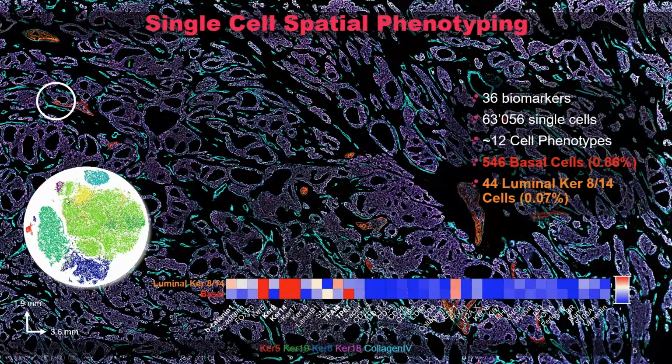You can see a very large contingent here of sort of green cells. Those will be luminal cells, a type of epithelium. Down here in blue, you have another type of epithelium. Up here will be vascular cells. I know these things because I've looked at these data many times over. But what I would like to point out to you is this small contingent here of red and orange cells.